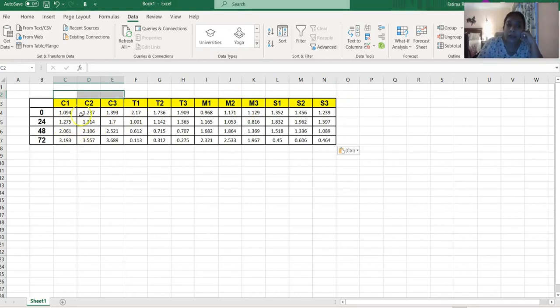And then you have the absorption after the stain has been solubilized and quantified at each of those time points for each of the samples. Now, if you just look at the numbers for 0 hour, you will notice that most of them are around this 1.2 point, but there is some variability. Like this one is 1, even here's one that's 2.17. So there is a little bit of difference in the starting confluence, and we want to make sure to take that into account as we run our analysis.